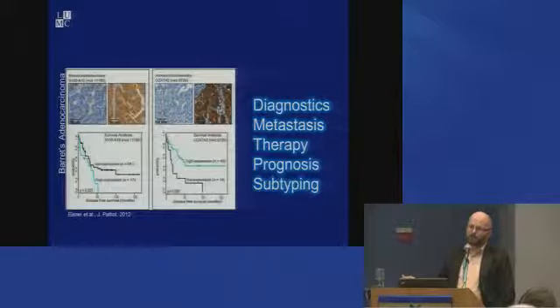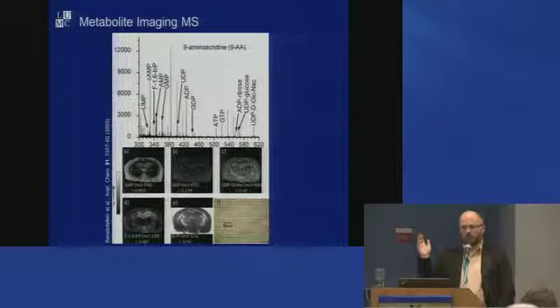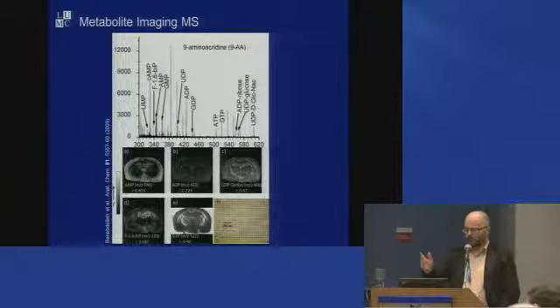MALDI and electrospray are not the same. For example, we just submitted a paper where we have this one peak, 4,156 m/z, from intestinal mucosa. We took an extract and performed top-down LC-MS using a top-of-the-line Orbitrap. And we identified more than 6,500 non-tryptic protein fragments by top-down MS/MS. Didn't have that one peak of interest.